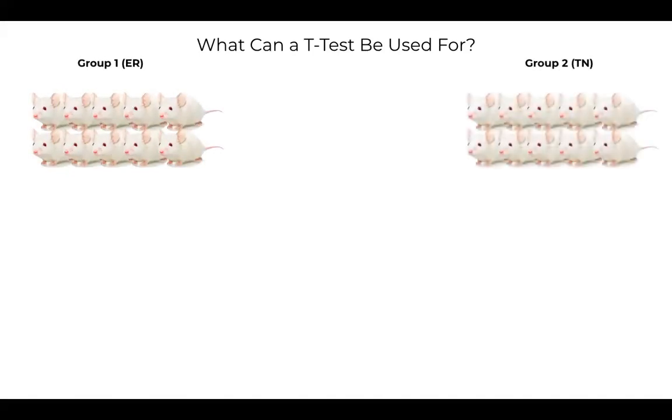To understand how these methods work, we did an analysis, and we took another look at the RNA-seq data to understand what observations we have and how to study variations that are observed in a group of samples. So we saw a group of samples last time. We looked at an example where we collected 100 mice and divided them into two groups, 50 having ER positive receptors, and 50 having triple negative breast cancer subtype.